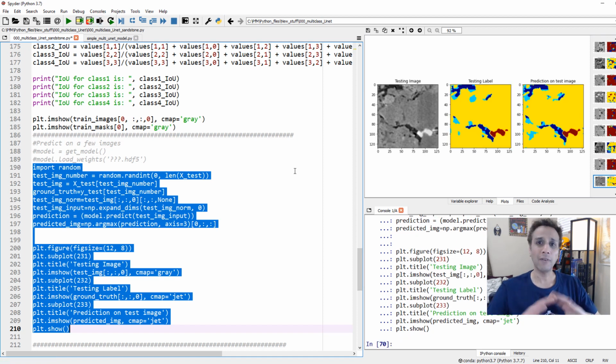But anyway, after 30 minutes, you have seen how we can use the standard U-Net, extend it to multiclass, and change the way we supply our inputs, and that's pretty much it. Everything else is pretty much straightforward. In the next tutorial, let's take this trained model and apply it to large images, automate it for many large images, and stack them together for a 3D data set. Again, this is not going to be true 3D kernels because that requires a lot of computation. Look up 3D U-Nets. If I have time, I'll do those someday. But for now, let's do large images and stack them together in the next tutorial.